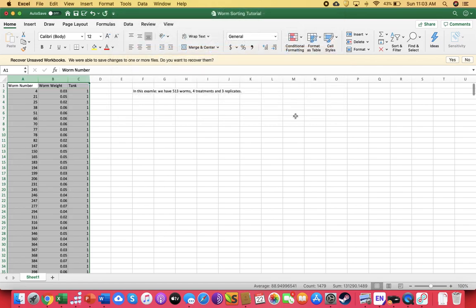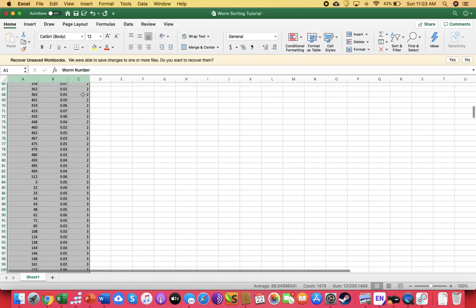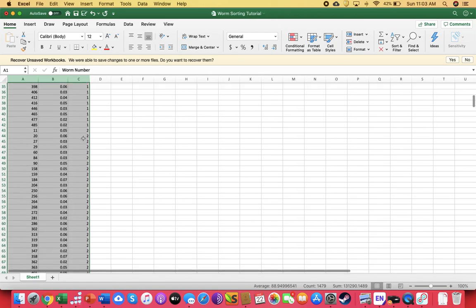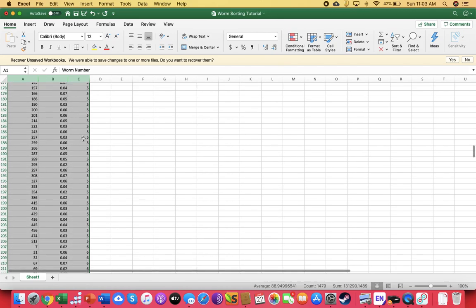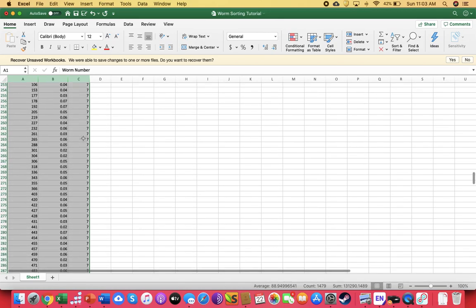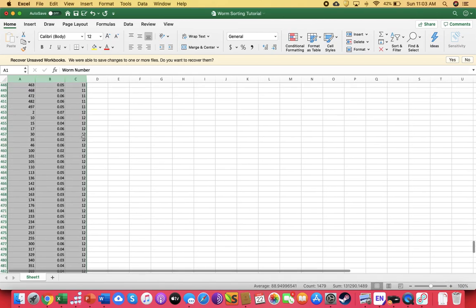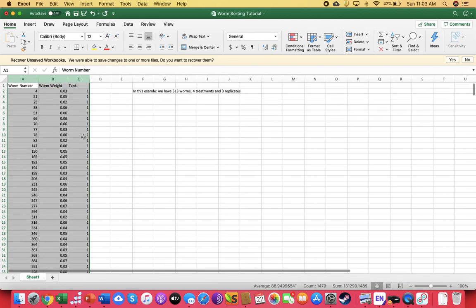Okay, so now you can see that these worms, let's just make sure we got everything nice. First thing that I'm doing, I'm scrolling down. I'm making sure that we have a bunch of 1s, a bunch of 2s, a bunch of 3s, and we don't have any weird funky stuff going on right here. Okay, this data looks good to me. I didn't mangle it. Sometimes it mangles. That's why you save. Oh, let's save. Just saved. Okay, so now all these worms go into tank 1.